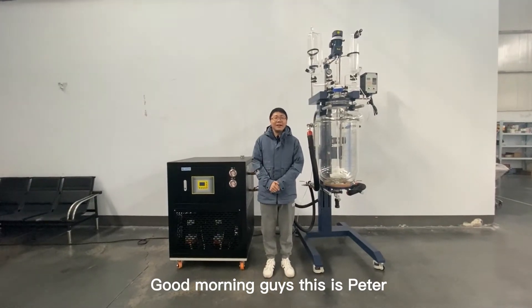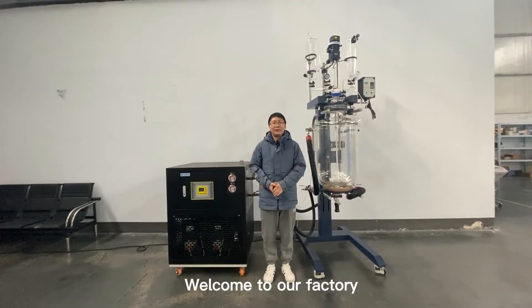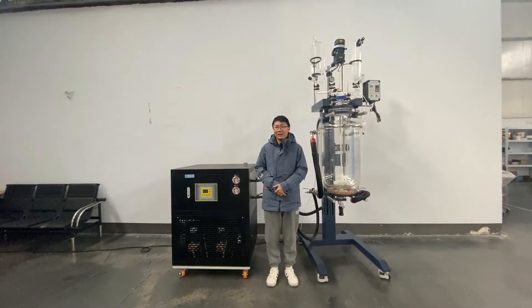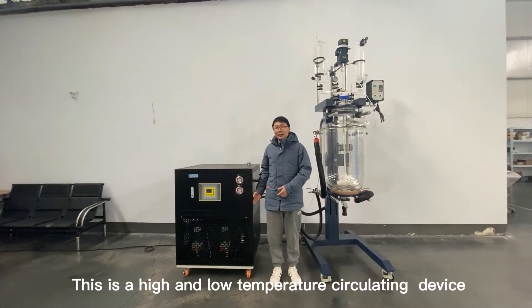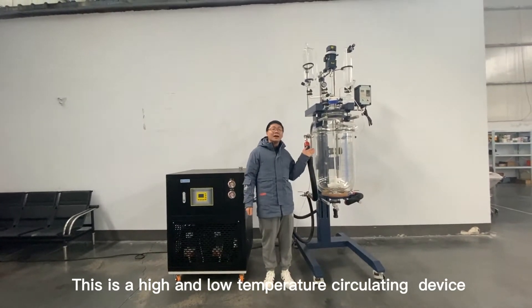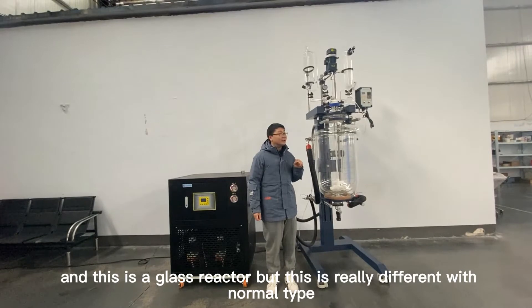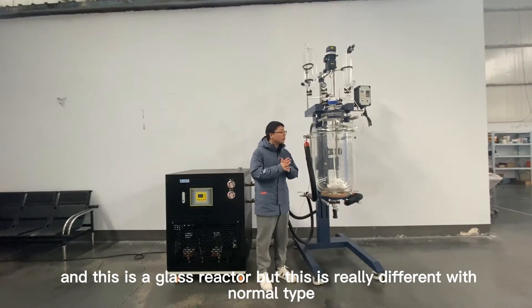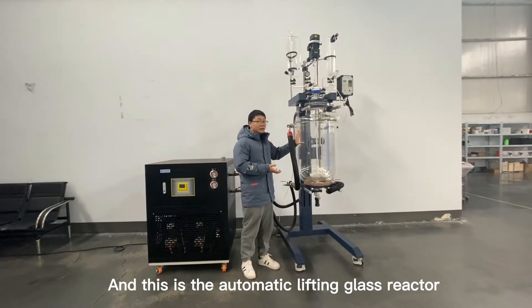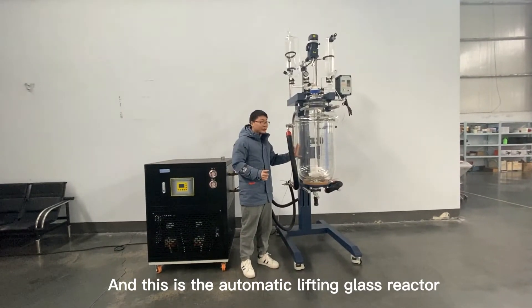Good morning guys, this is Peter and welcome to our factory. Today, beside me we have two big machines: this is a high-low temperature circulating device, and this is a glass reactor — but this is different from the normal type. This is an automatic lifting glass reactor.